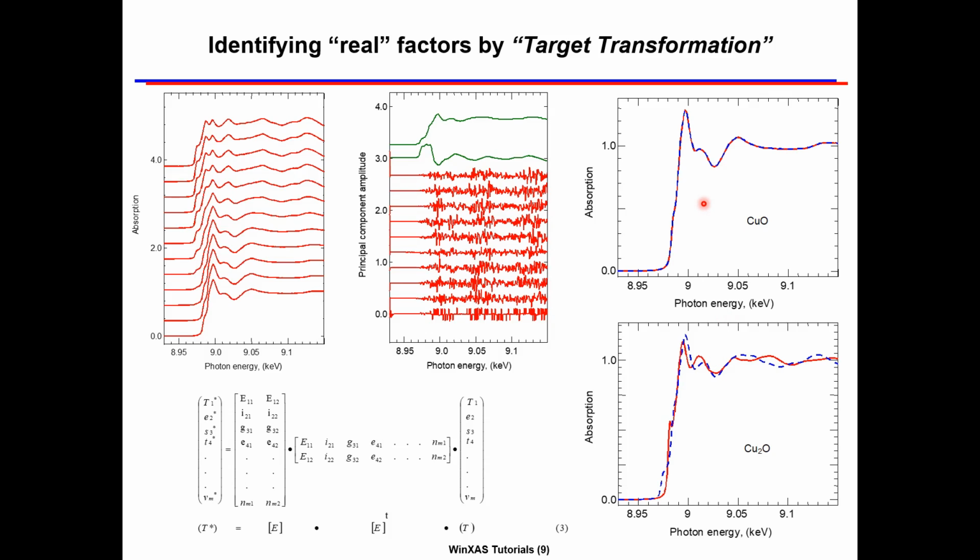In this manner, all spectra in the database are tested, hopefully resulting in a number of references that corresponds to the number of primary components. If this is not the case, quantifying the phase composition of the mixtures in the series of experimental spectra is not possible.